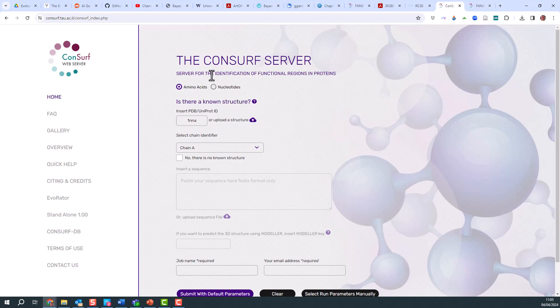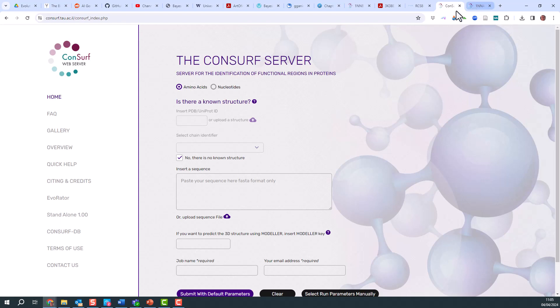As well as using the CONSURF server that way, what I could have done is said that there was no known structure. In this case, I'm going to put in an N9 sequence. If I put in the sequence, it will do an analysis of the database, find the sequences, and then construct this conservation pattern based on the conservation of amino acids in the sequences.